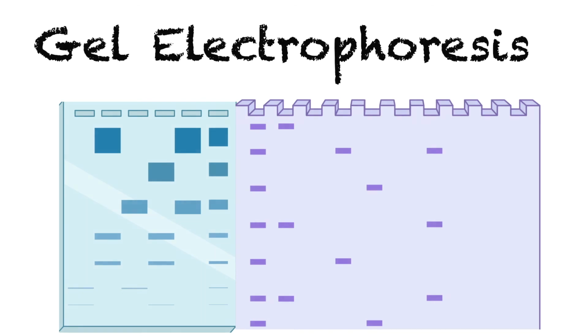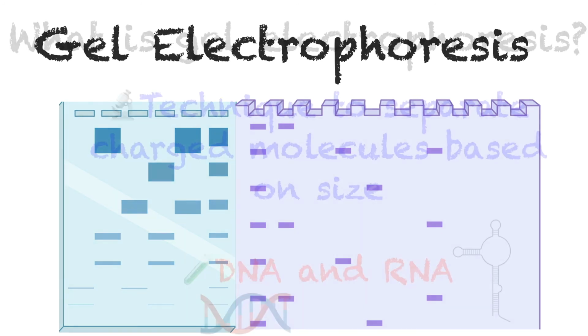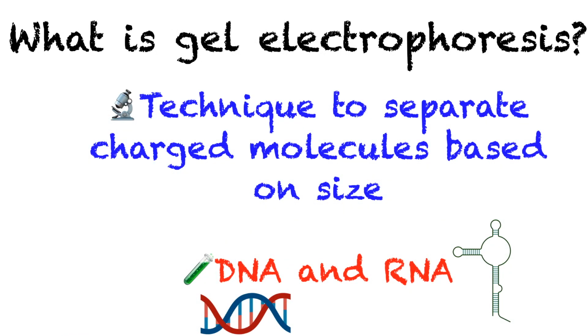Today I'm talking about gel electrophoresis. I'm talking about what gel electrophoresis is and why we use gel electrophoresis in biotechnology. Now, what is gel electrophoresis? Gel electrophoresis is a technique to separate charged molecules based on their size.